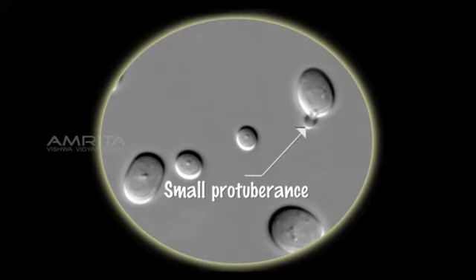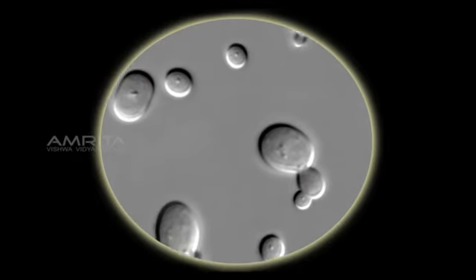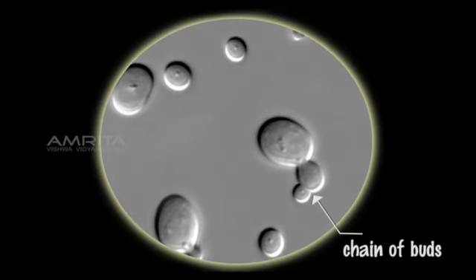Observations: we can observe that cells of the yeast are spherical or oval in shape. First, a small protuberance appears on the body of the parent cell, known as a bud. We can observe these buds in the permanent slide of budding in yeast. We can also observe a chain of buds on the parent yeast cell.